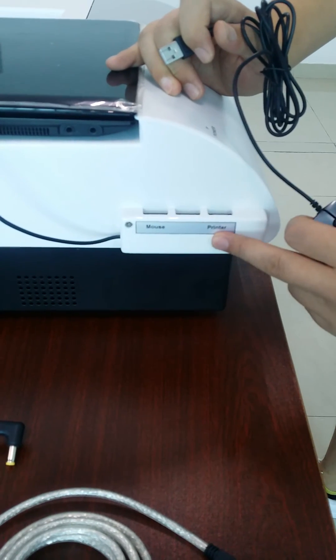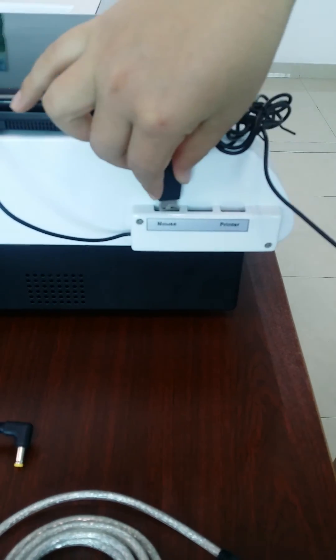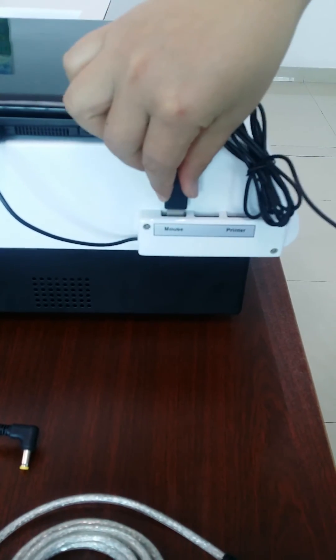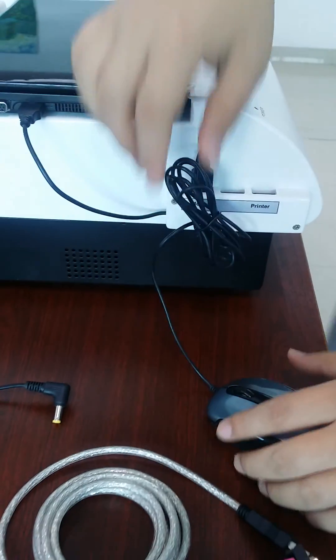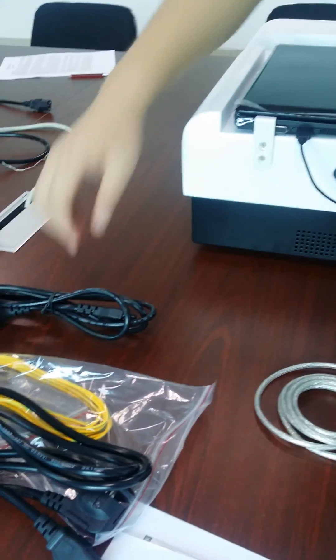There are three USB cables: the mouse, the printer, and another device. After you do this, you will be able to connect the power to the computers.